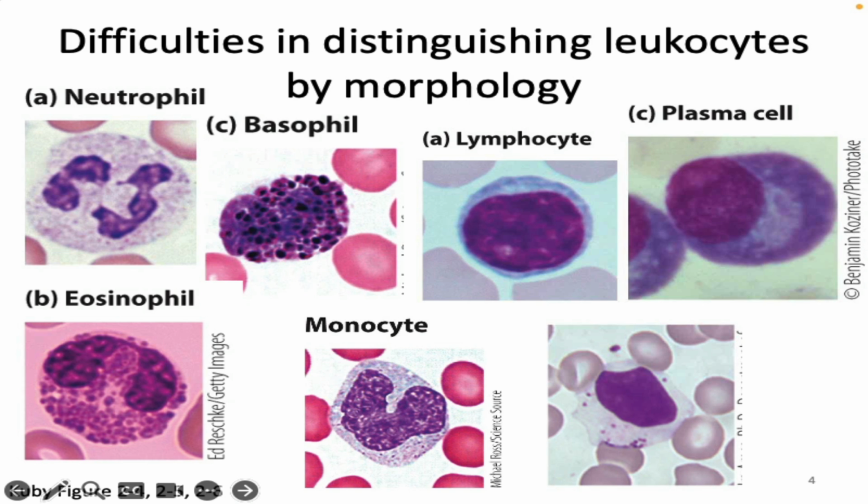So what would a larger sample help us with? You could get a lot more accurate if you weren't doing 100 cells, if instead you tried to do 100,000 cells, right? How would you feel if I asked you to repeat Lab 1, but tell me 100,000 cells? You're all making some excellent faces about that.